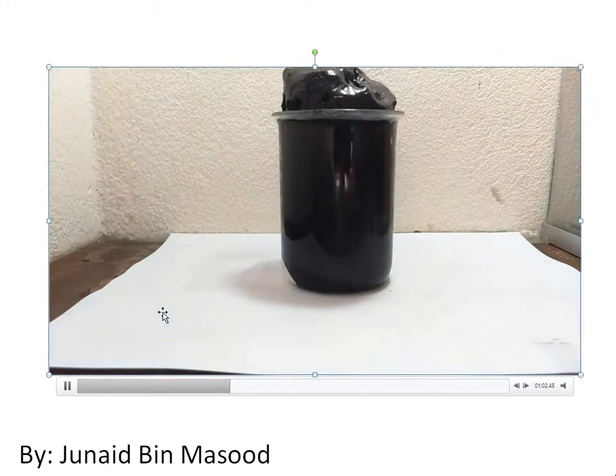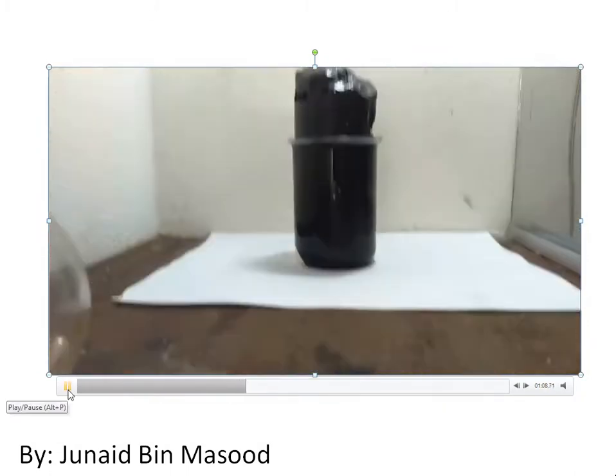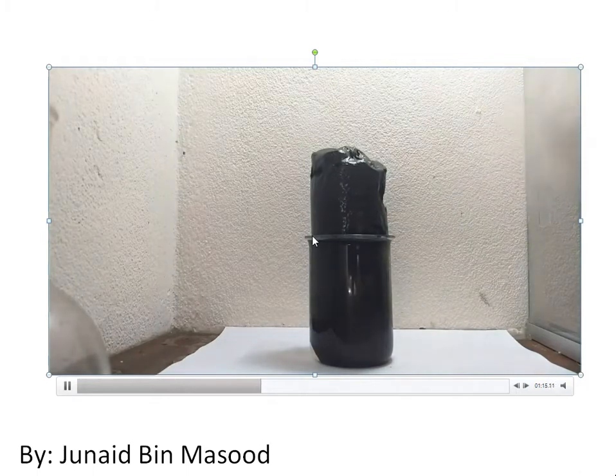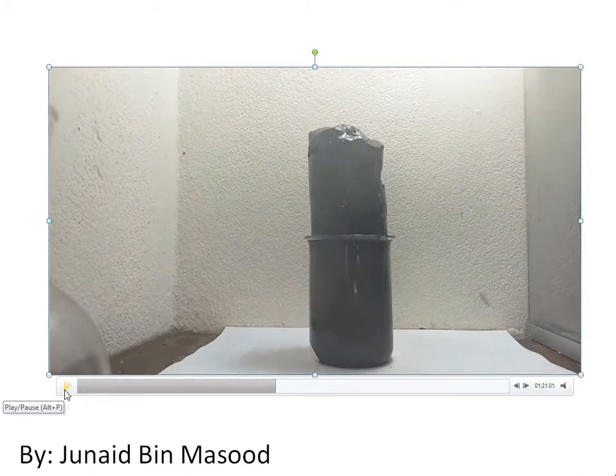Okay, so this is sulfuric acid with sugar. So this is what happens when it reacts together to produce carbon and water. You can see the steam and it's rising. This is really amazing, guys. So I'll just pause the video now.